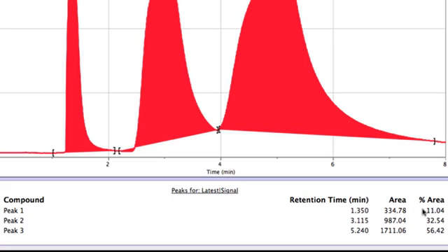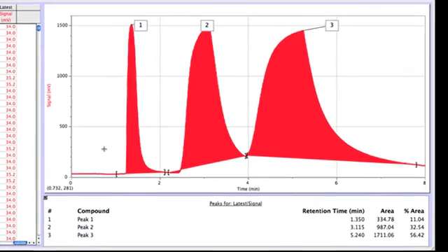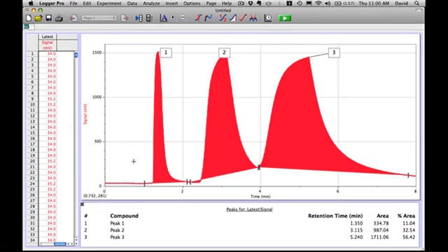This information can help me understand more about the substances in the mixture, or if I happen to have run the standards before, I can identify each one of the peaks based on their position and their peak height based on the parameters of temperature and flow rate that I had set earlier.